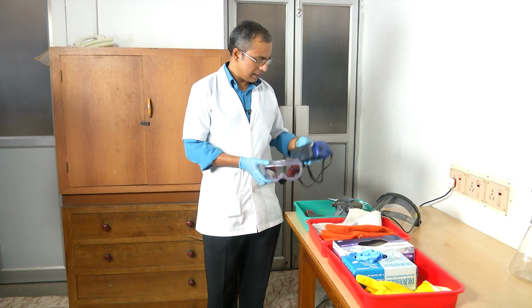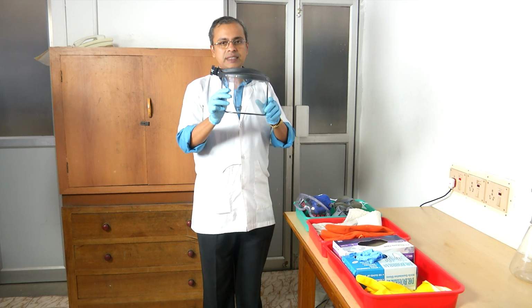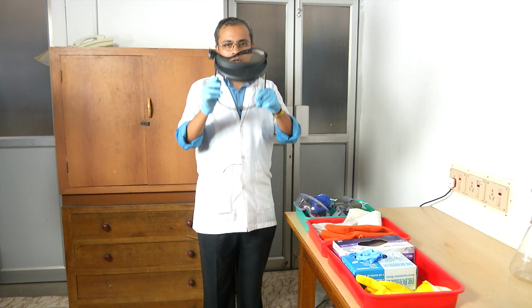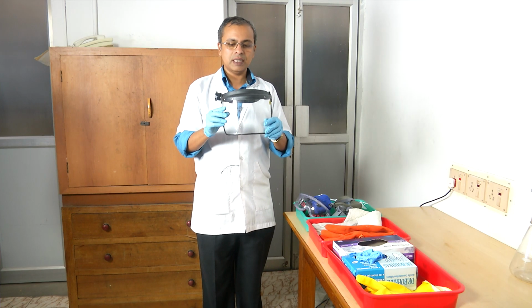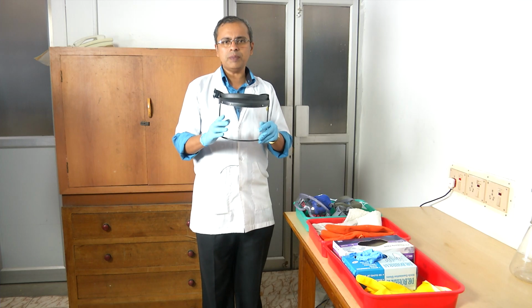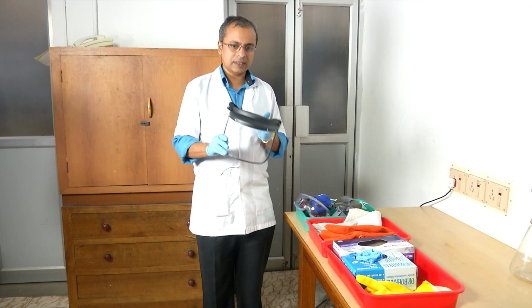in case you are seeing something that has a strong glare associated with it, and you also have something which is basically a shield that covers your face, a much broader region of your face, which you can then use to do certain other types of experiments. So, these are a few different types of safety equipment that you can use, which would primarily protect your eyes, but would also cover a fair fraction of your face.